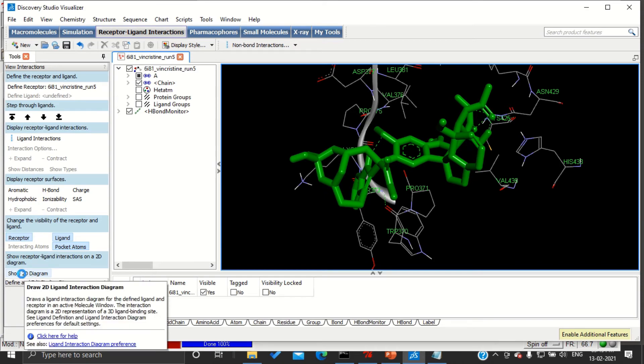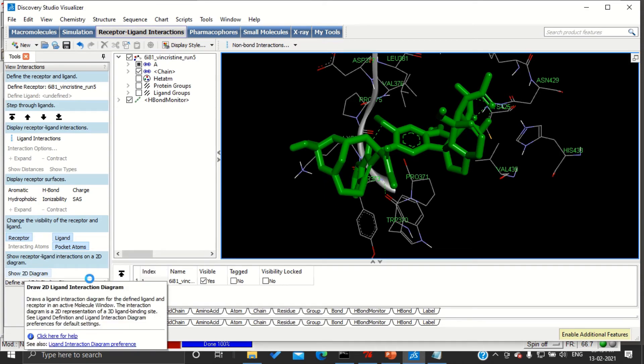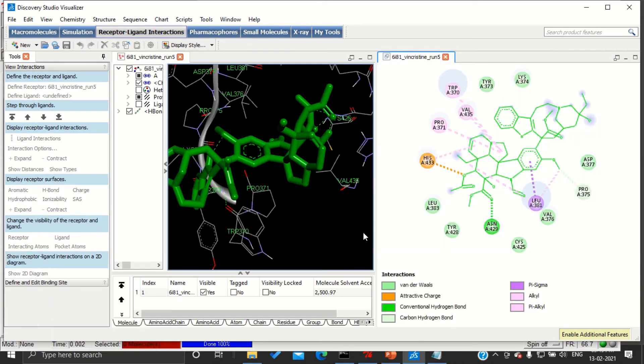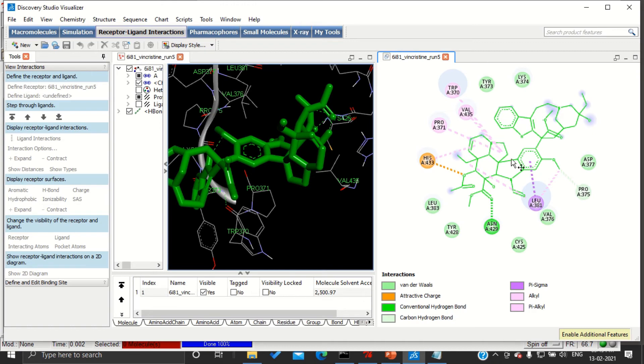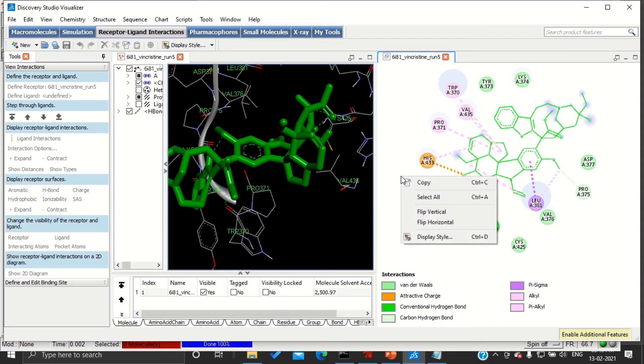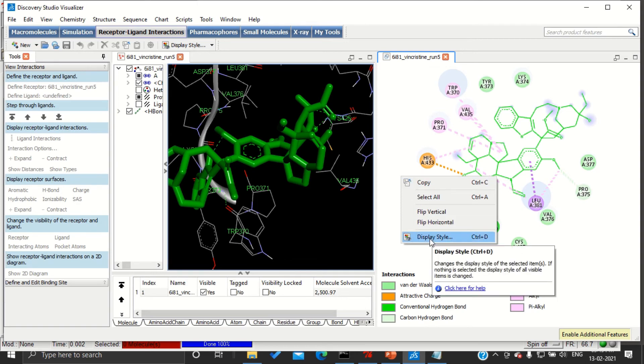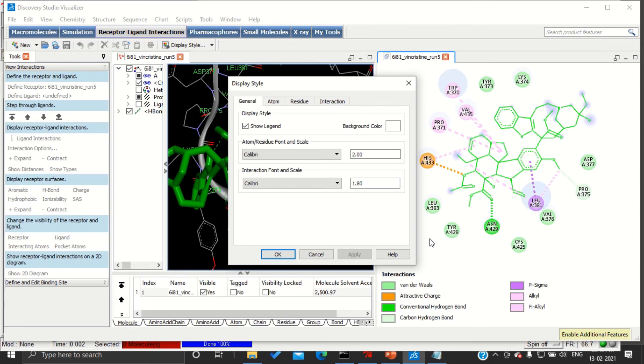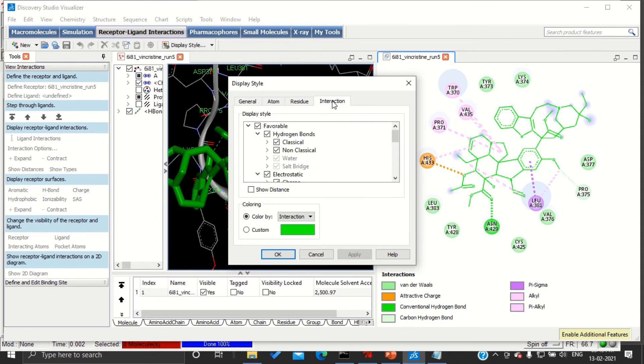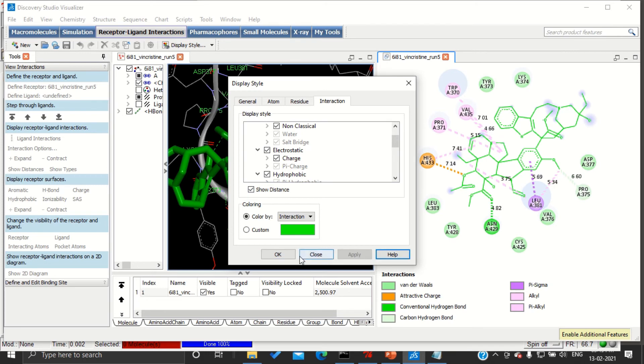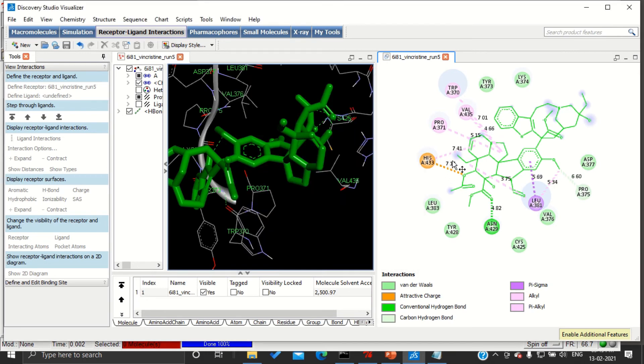Here you can see the structure of our vincristine and its interactions with various amino acids of our protein. If you want to see the distance between the amino acid and our drug, go to display style and here interactions, show distance, apply.